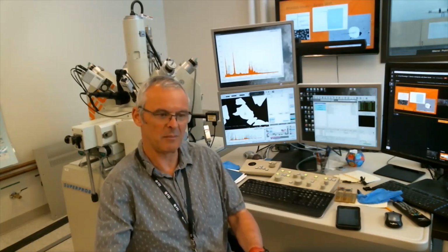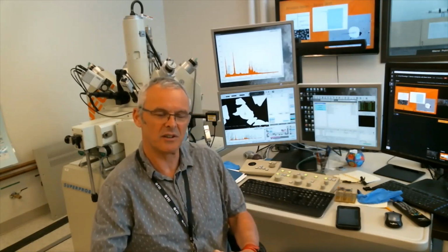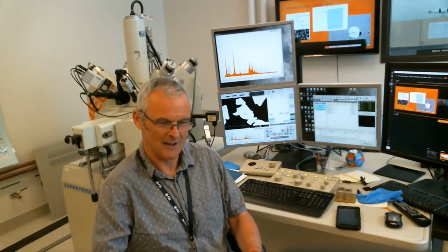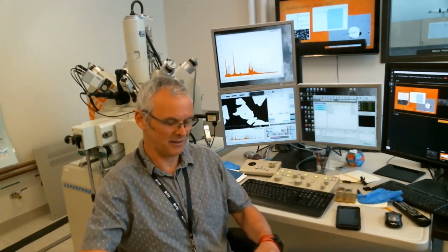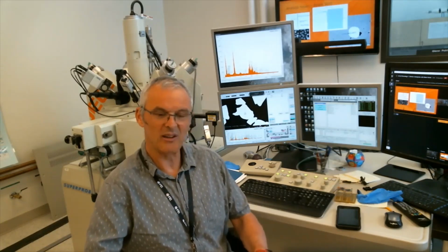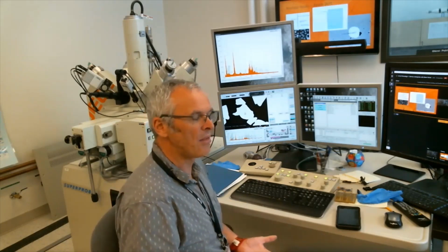Okay? So we have maybe 10% of that beam, depends on the consideration, scattered around that point. And that beam's still got all that energy. So it's generating X-rays, not just where we think the beam is down, but generating X-rays in an area around that. And this is one of the biggest issues with using low vacuum mode in minerals.